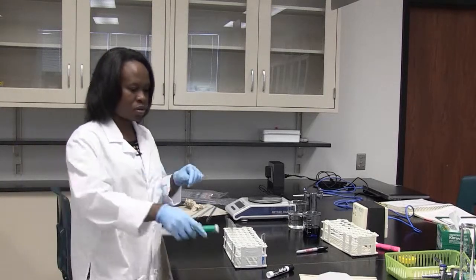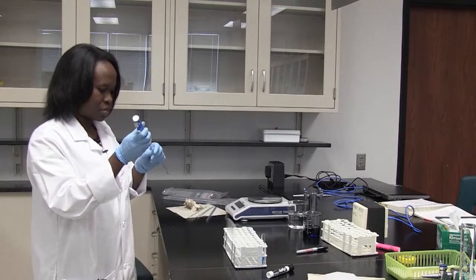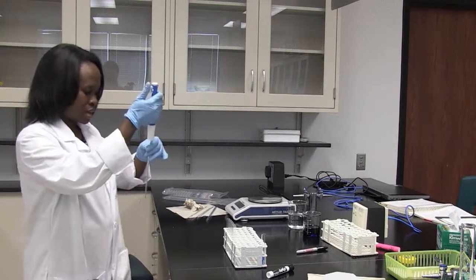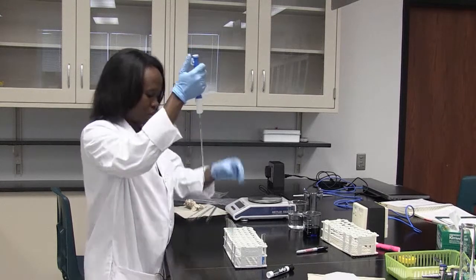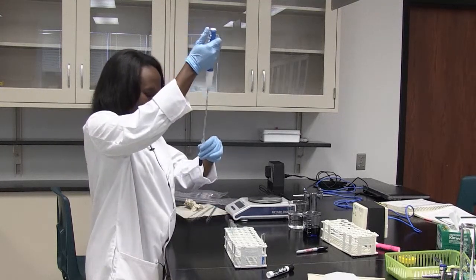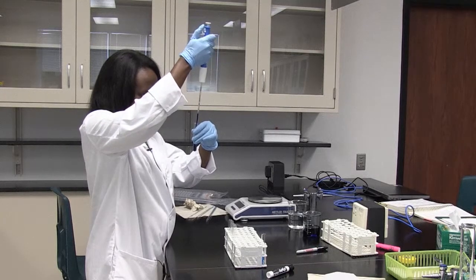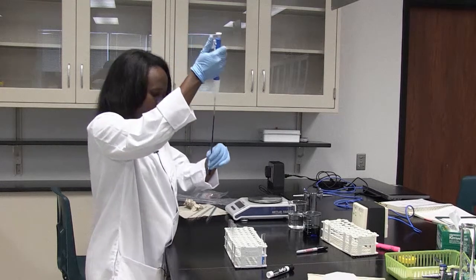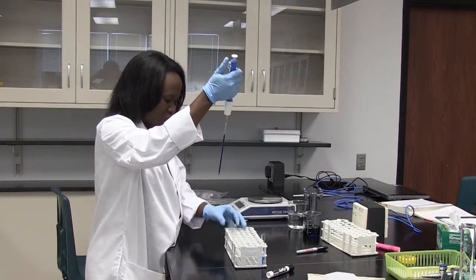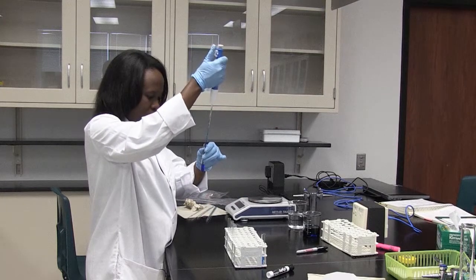So this is how I will do this. I already have my water in my test tubes, so the only thing I need now is to add my 1 mL of stock dye. This is blue dye. I'm going to make sure I mix it by pipetting up and down, so I mix it thoroughly.